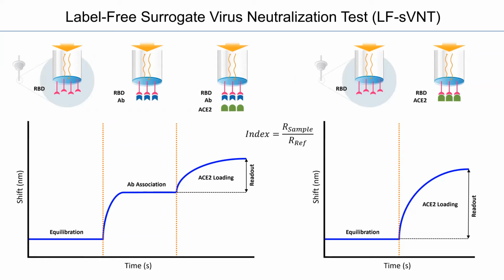As we know, both concentration and avidity are components of the overall antibody neutralization activity, which can be quantified by the neutralizing antibody titer. And the next question is, how do we measure the neutralizing antibody titer in each serum sample? We followed the concept of surrogate virus neutralization tests to design a label-free immunoassay for this purpose. The label-free immunoassay is illustrated in these graphs.